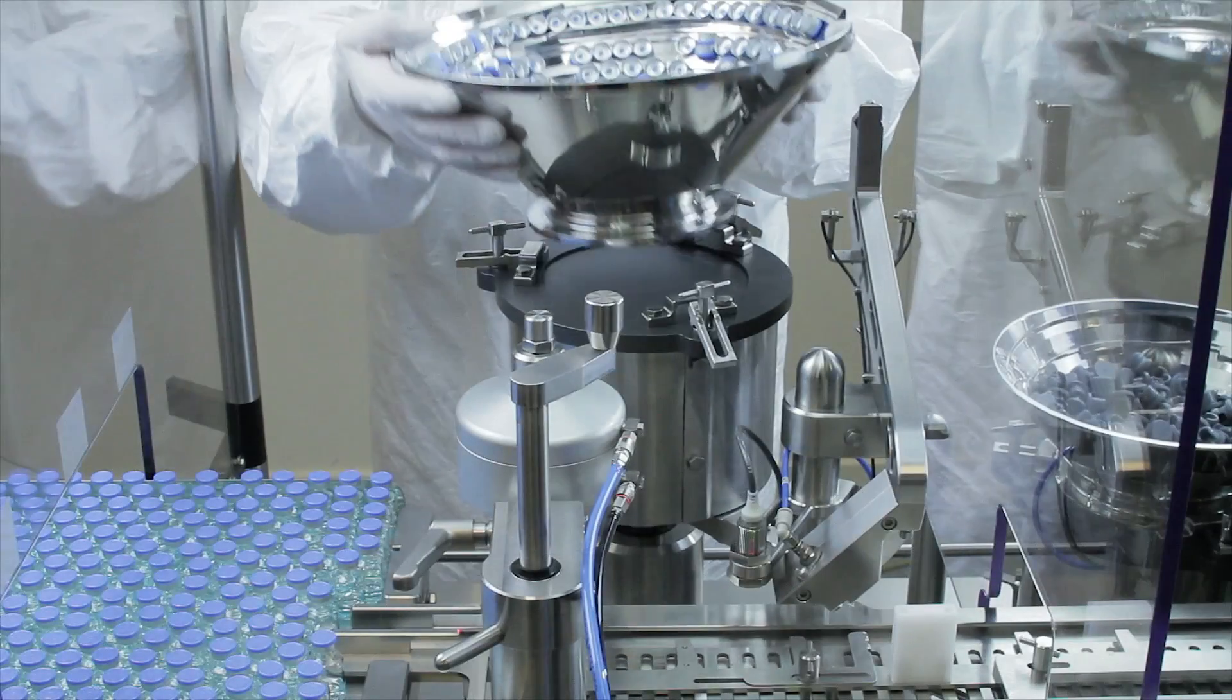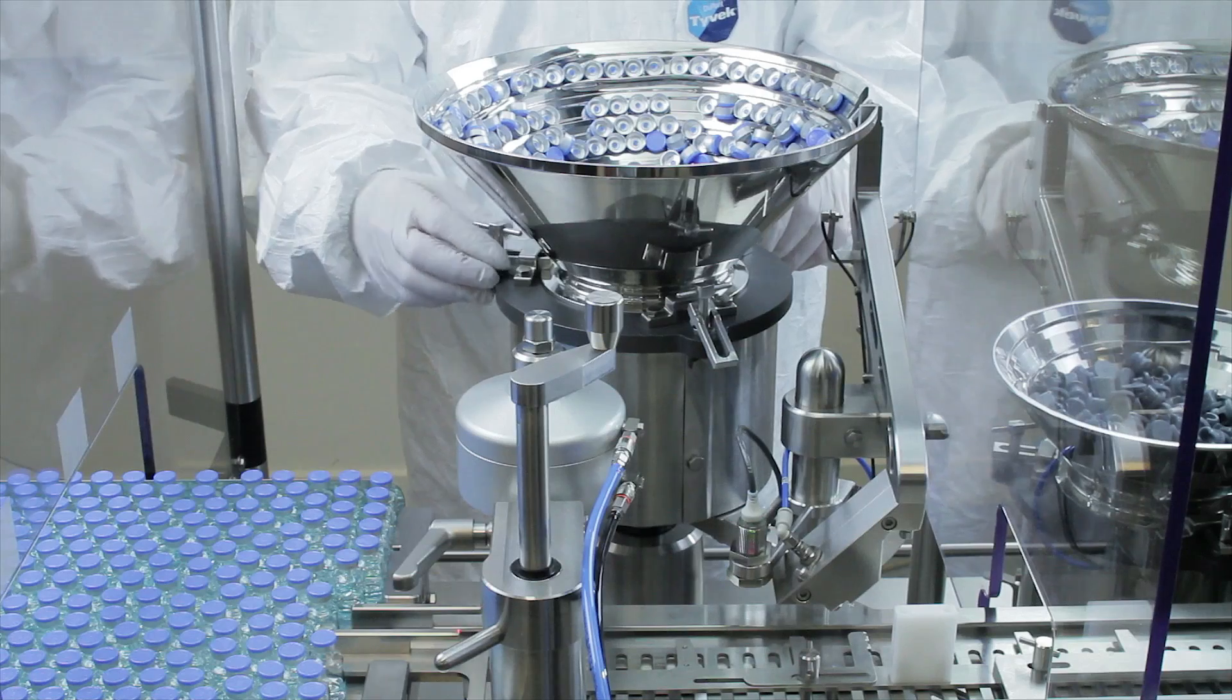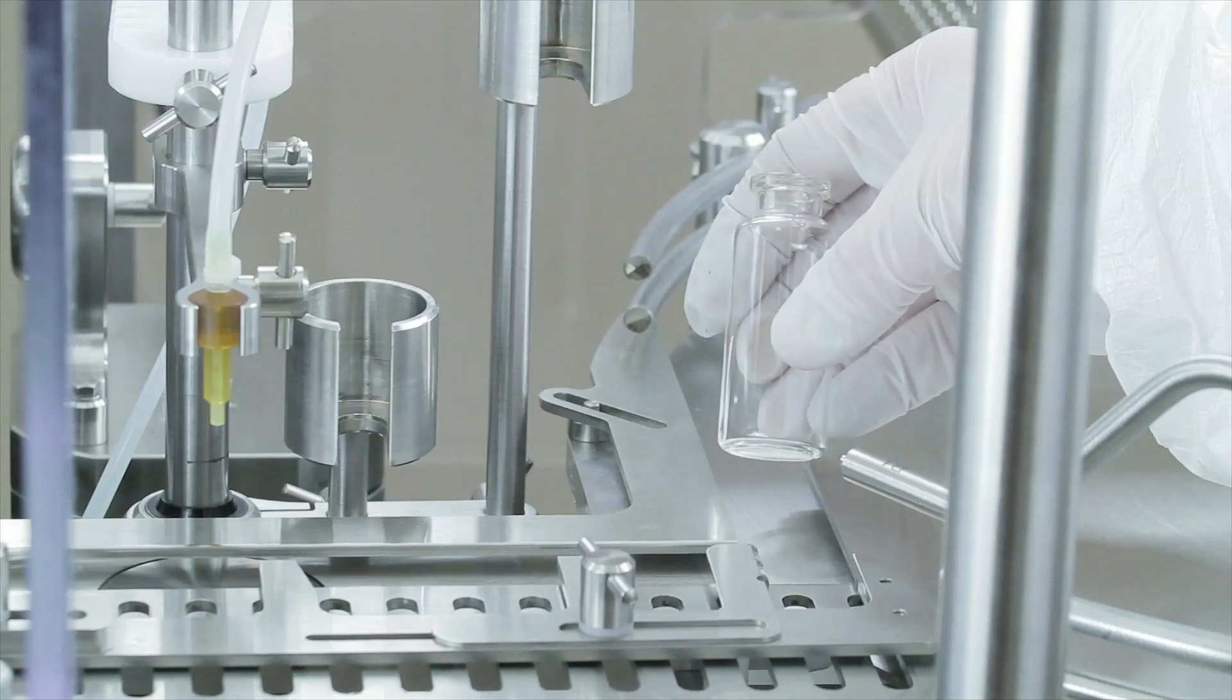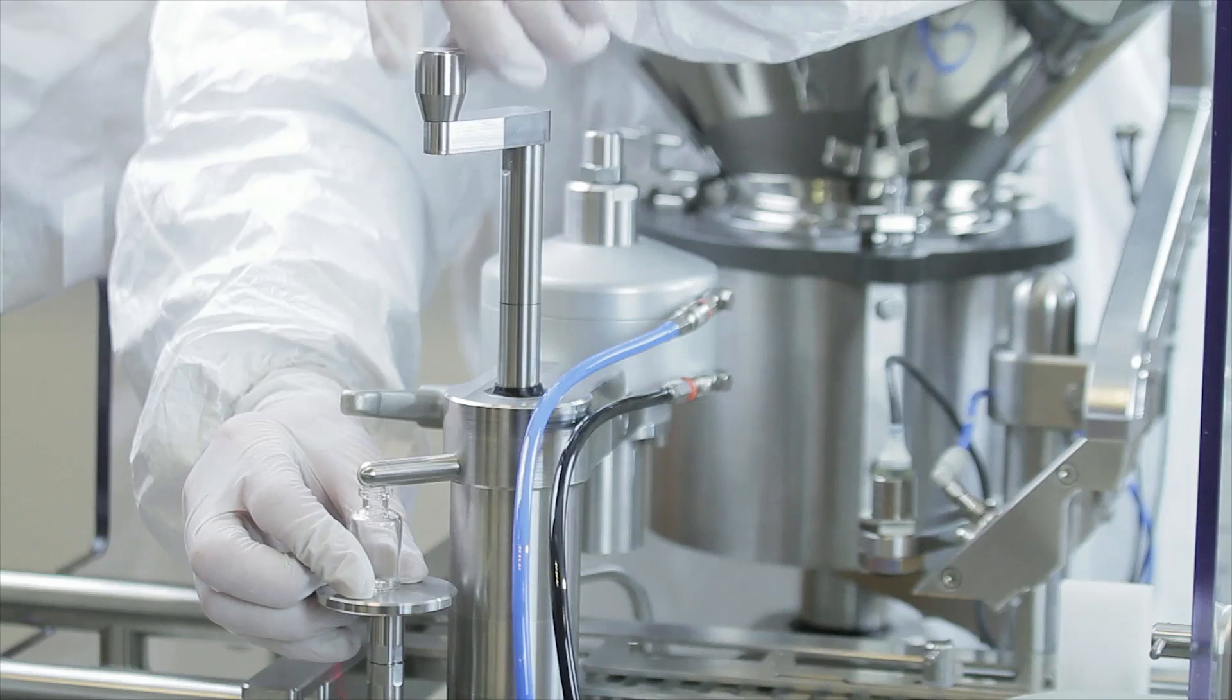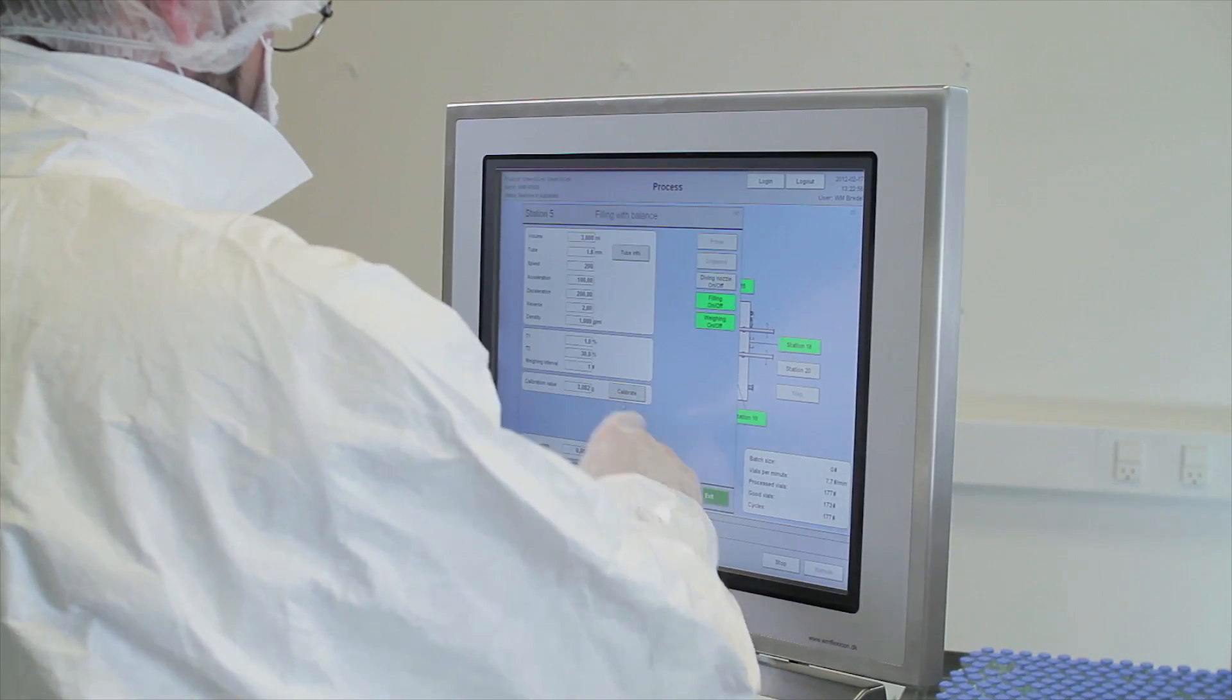Changeover for different size vials, stoppers and caps can be done within minutes by the operator using a few universal parts. No special tools are needed and no additional support is required from outside of the cleanroom.